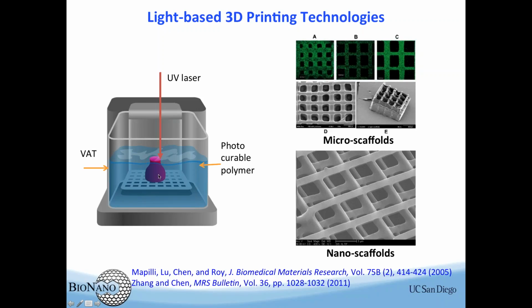this demonstration here. Another nice thing about light is, we have tons of supporting technology from the semiconductor industry about light control, size, and interaction with the material.